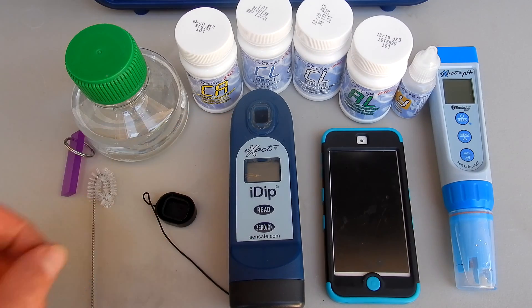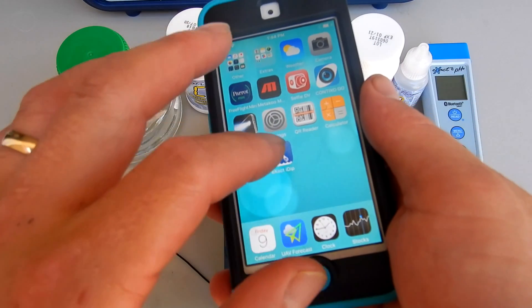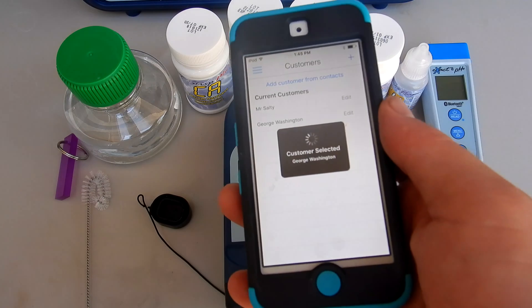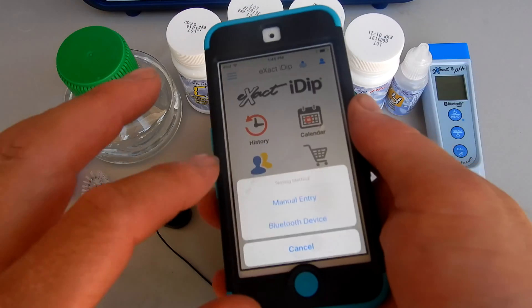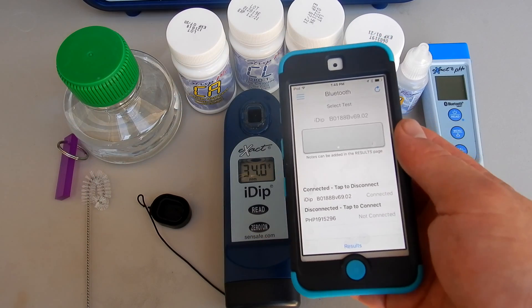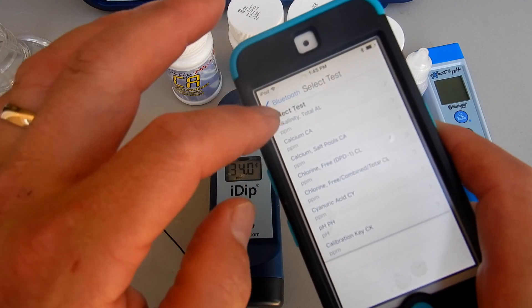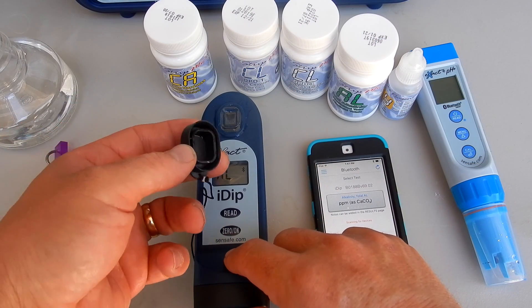For this video I'm going to show you one of the test factors. First, turn on the Exact iDip, then open up the Exact iDip app. Click on customer — I had put a customer in earlier, so the results will be saved under George Washington. Go to test, click on Bluetooth device, and connect the iDip. Now pour a water sample into the chamber, filling it all the way to the top. Then select the test — I'm going to click on the alkalinity test. To zero out the Exact iDip, take the included cell cover, cover it up, and hit the zero button.